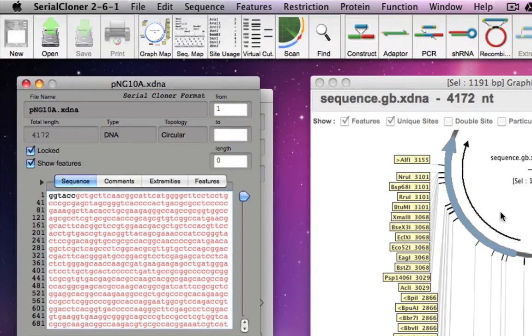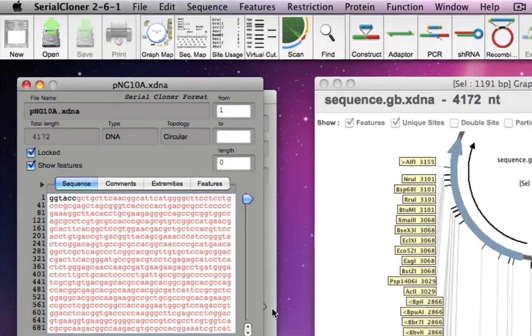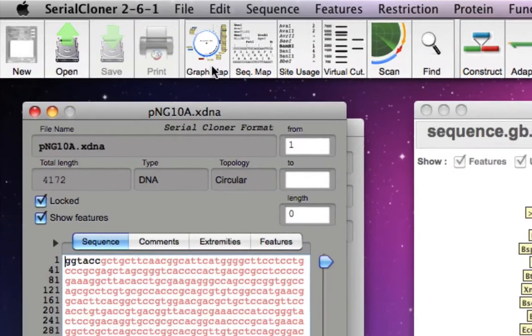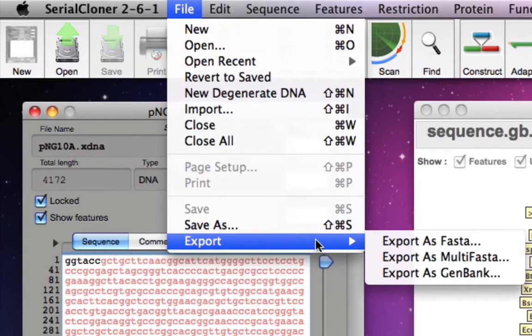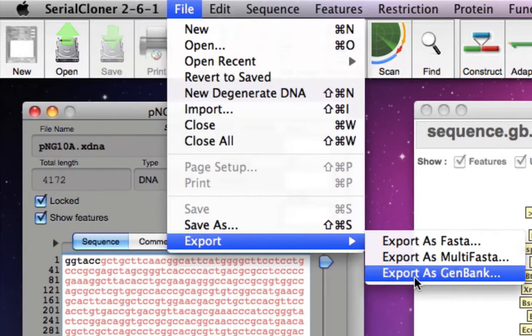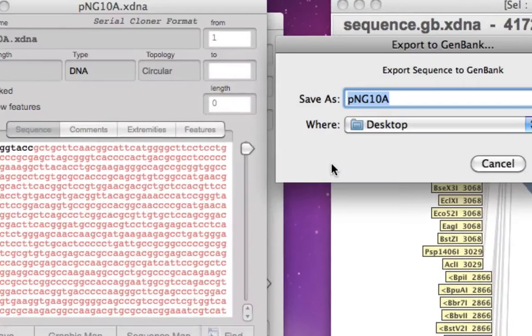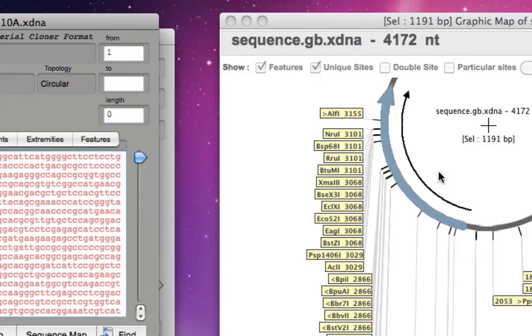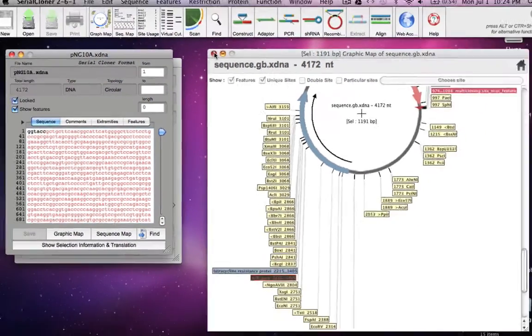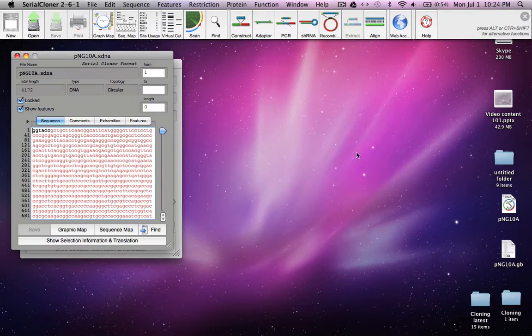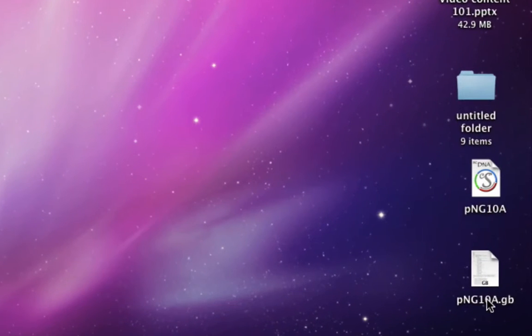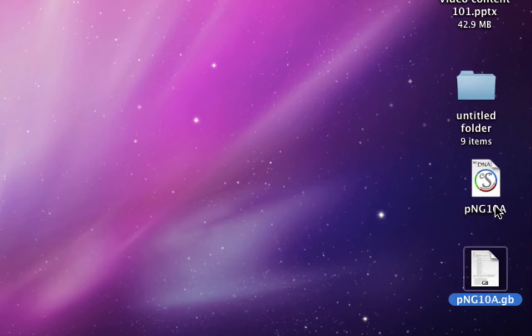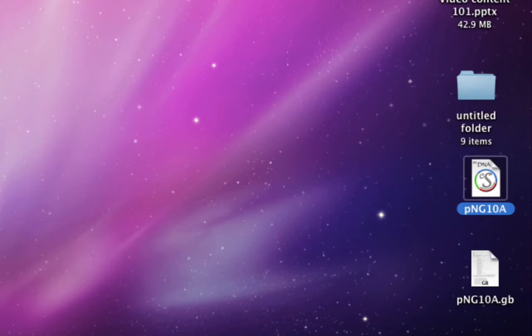You can also export it in different formats. Go to File and say Export, export as FASTA or as GenBank. Once you export the file in GenBank format or FASTA format, you can always send it as an attachment to your email or share it with your friends.